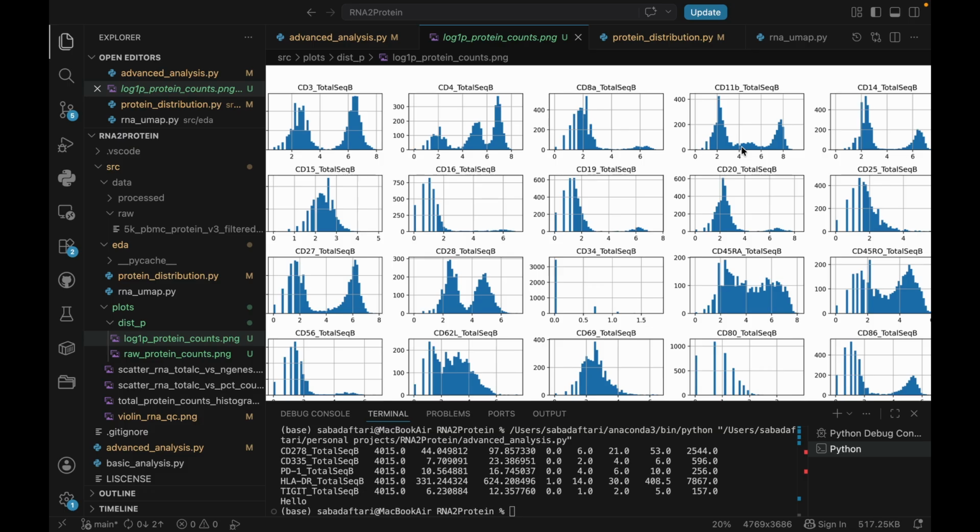And so it's more informative, and the model could learn a more complex pattern in case of a regression. Just from looking at the shapes, we now know that these bimodal shapes are the proteins worth predicting.